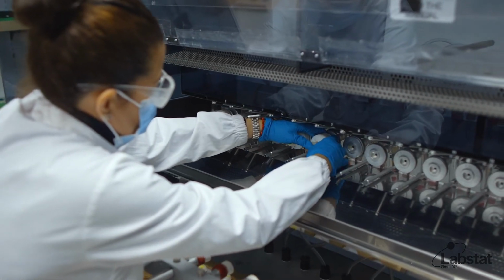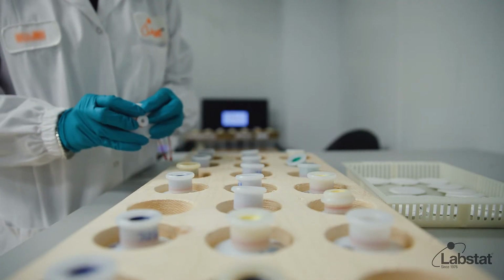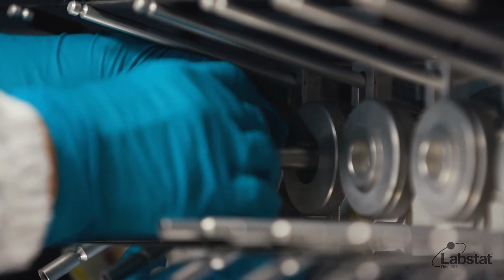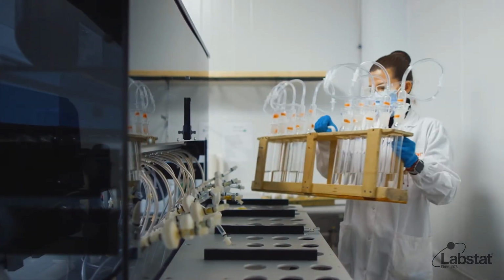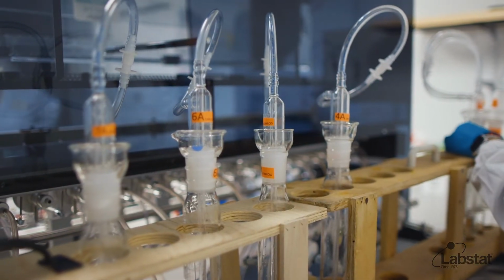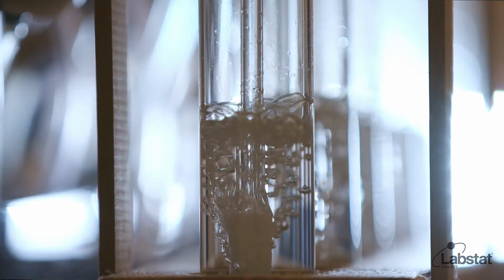With each puff the machine takes, the emissions are split into two sample collection devices. First, the technician prepares the glass fiber filter pads that will sit directly behind the vape pen to capture the particulate phase. Then, they'll attach the glass impingers to the corresponding ports on the back of the machine. Pre-filled with a solution that's used to extract particular analytes of interest, these glass tubes will capture the more volatile compounds or gases that pass through the filter pads.